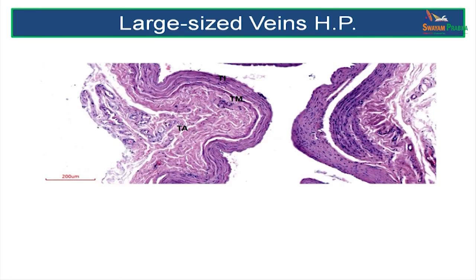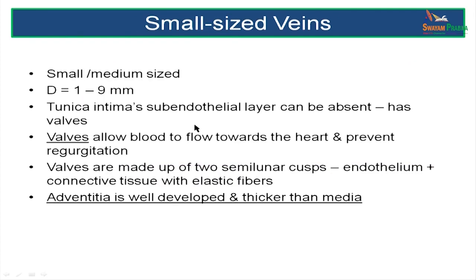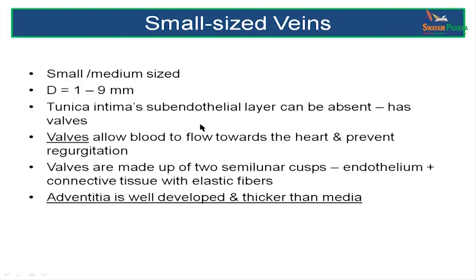In a high-power view of a large-sized vein, we see the thin tunica intima, a tunica media, and a large thick tunica adventitia. Small-sized veins are about 1 to 9 mm in diameter; their sub-endothelial layer could be absent. This vein also has valves allowing unidirectional flow of blood, and the adventitia is well developed and much thicker than the media.